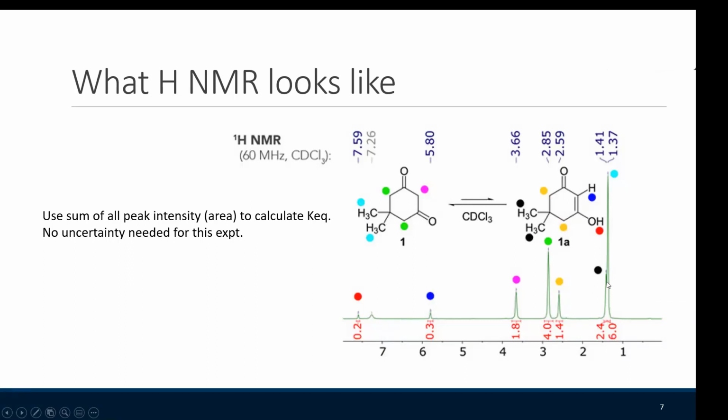You have two ways of solving the overlapping peaks. One would be similar to what I did here. I do the integration twice.